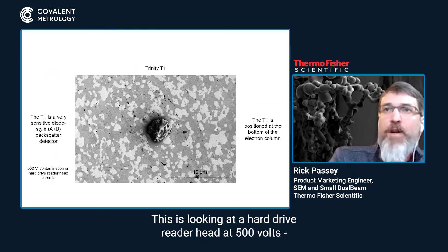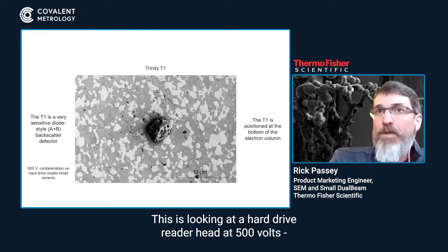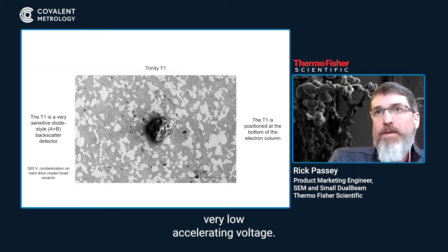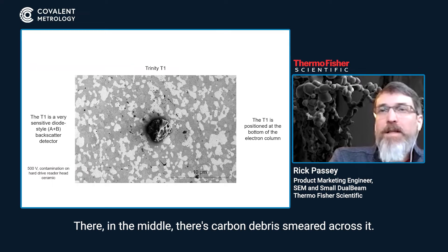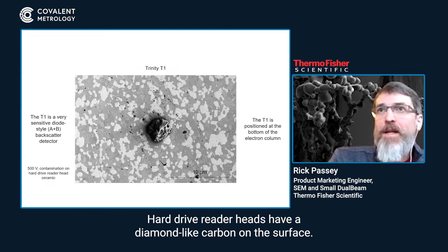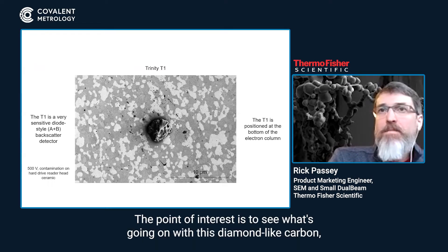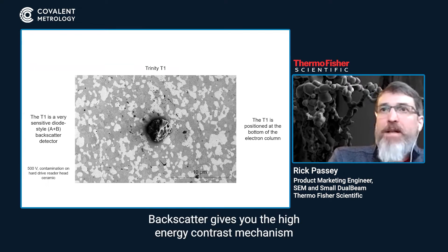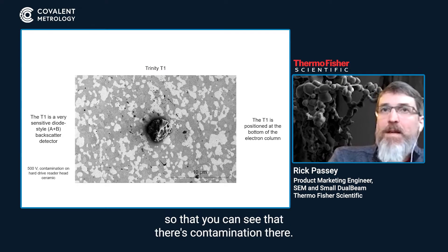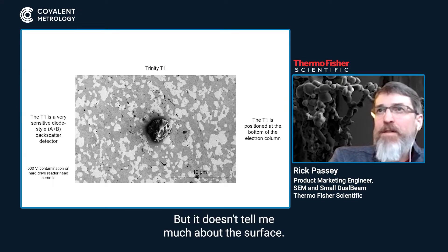This is looking at a hard drive reader head at 500 volts — very low accelerating voltage — giving a nice backscatter image. There's a carbon particle in the middle with some carbon debris smeared across it. Hard drive reader heads have a diamond-like carbon on the surface, so the point of interest is to see what's happening with this diamond-like carbon, not the ceramic underneath. Backscatter gives you the high-energy contrast mechanism, so you can see contamination there, but it doesn't tell much about the surface.